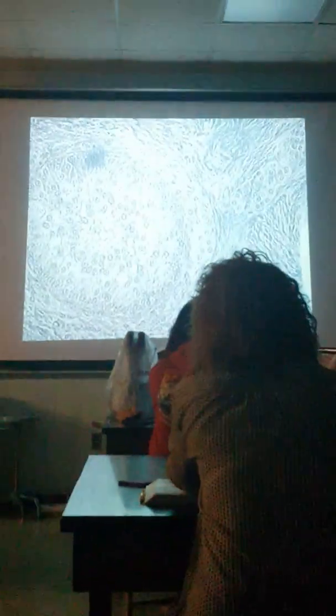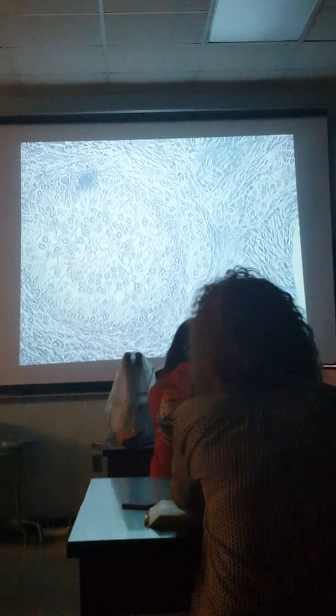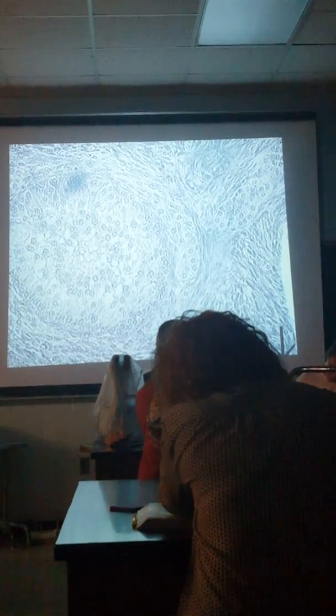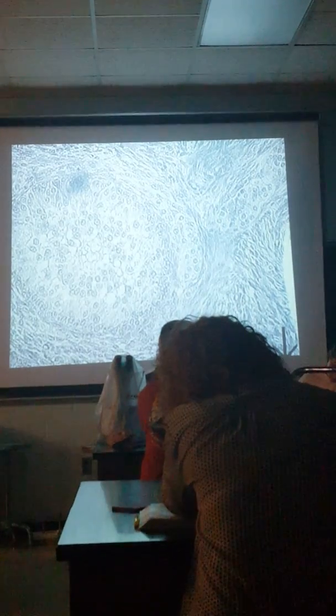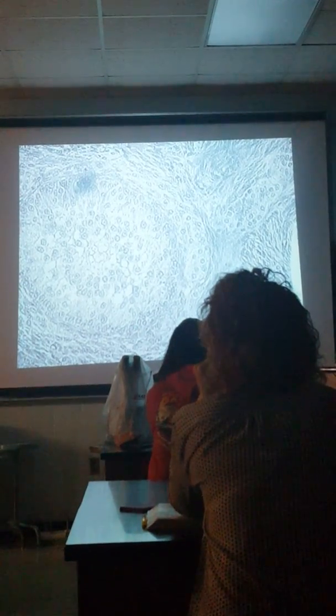Sometimes the oocyte is not in view. Why don't we see oocyte in this? It should be there, but why don't we see it there? If you imagine you're cross-sectioning through a follicle, if you're way parasagittal, way off from the center, when you section it, you're not going to hit the oocyte.